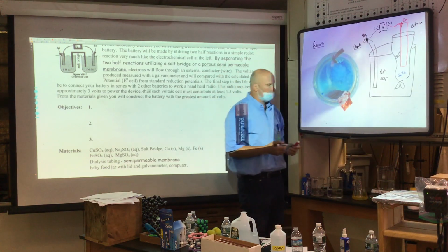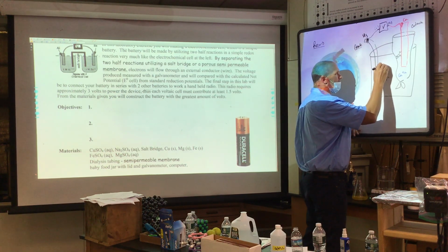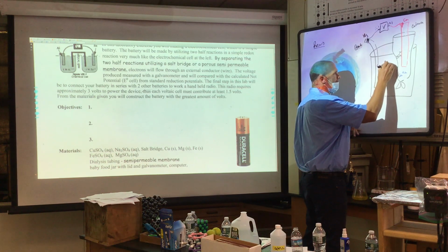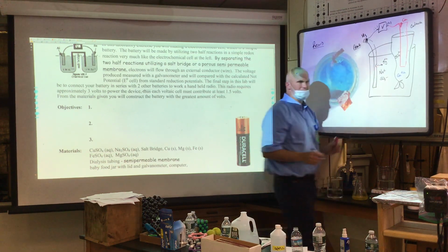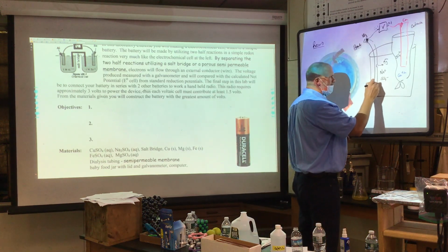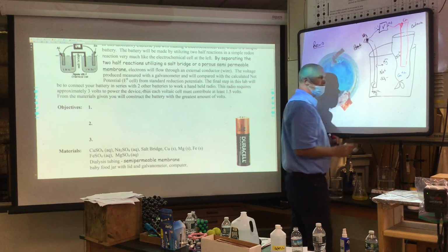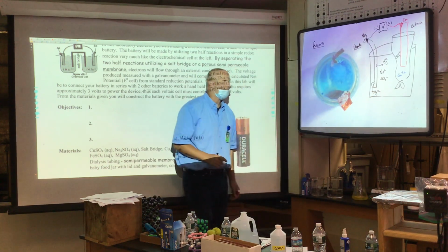And what's the oxidation? Well, solid Mg0 didn't disappear, but the solid became an aqueous ion in solution. You can't see ions. So over time, this magnesium became etched, where it was disappearing in terms of the solid becoming the ion.